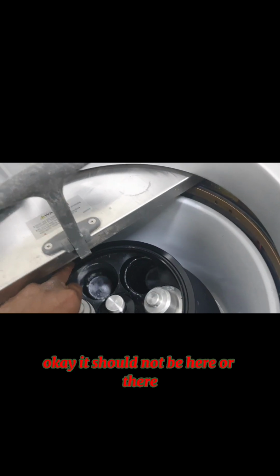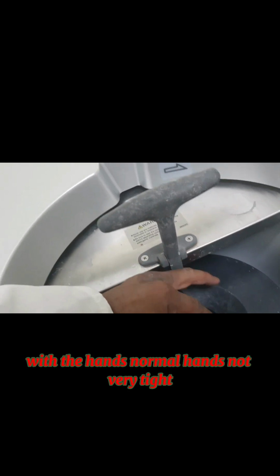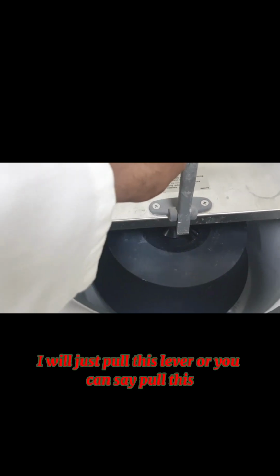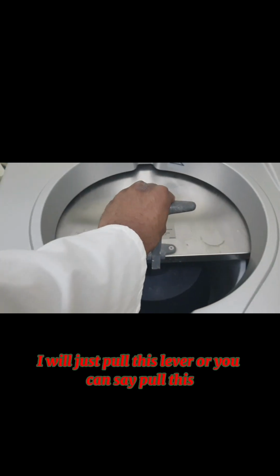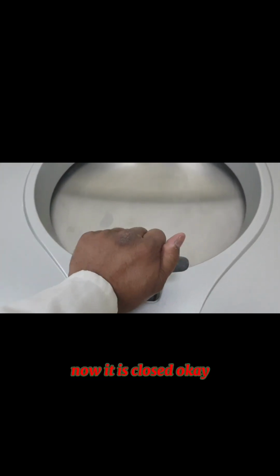It should not be here or there. Now we will simultaneously cap it from the top, and with normal hands, not very tight, we just have to close it. To close the lid, I will just pull this lever, or you can say pull the cover here. Now it is closed.